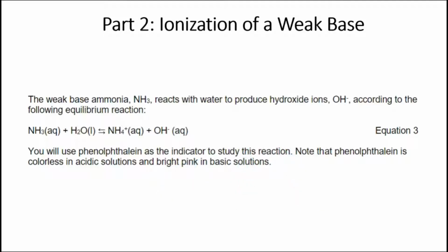Part 2 of this experiment is looking at the ionization of a weak base. So in this case, our weak base is ammonia, and the actual source in the experiment of the ammonia is ammonium hydroxide. And we're going to be combining ammonium hydroxide with water. And initially, this solution will be clear.